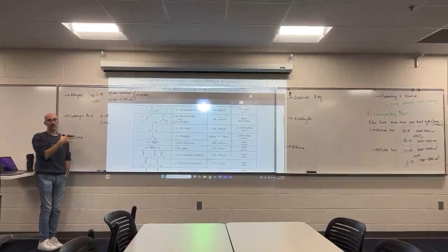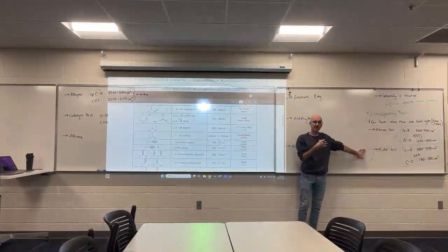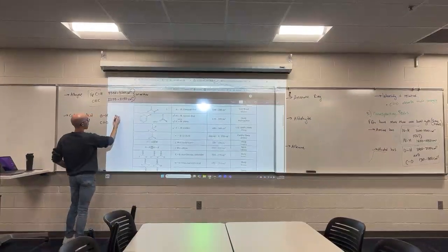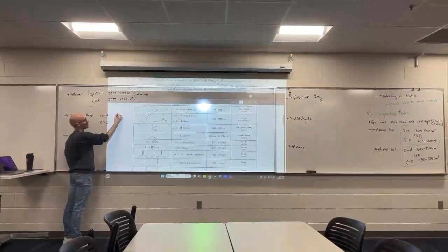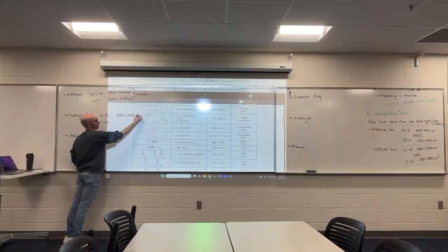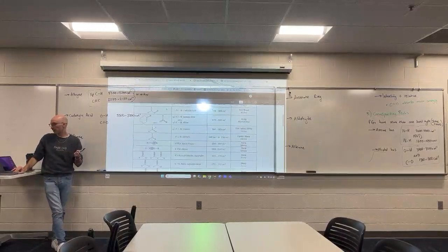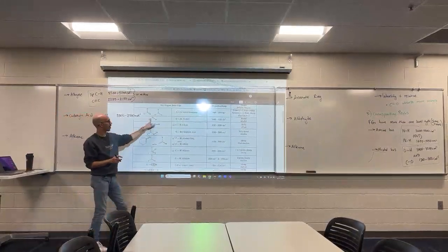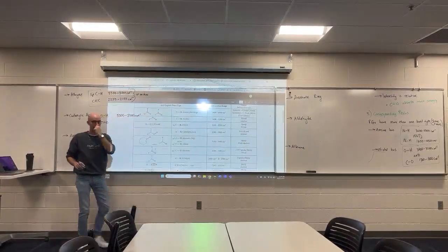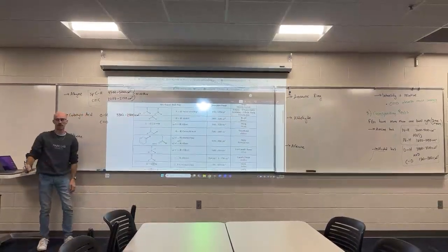And the OH single bond is different than the OH we expect from the alcohol. This isn't 3400 to 3200 broad, right? This is what? 3300 to 2500, very broad. That's a different OH absorption. I just want to point that out. OH alcohol absorbs differently than the OH of the carboxylic acid. It's 2800, not 2500. Thank you. Give or take a couple hundred wave numbers.